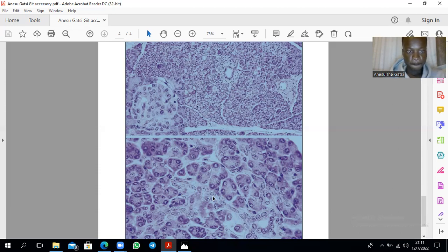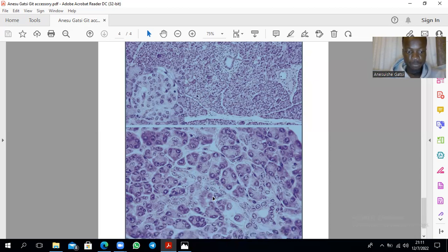Then that's another intralobular duct now. It's a bit larger as compared to the intercalated ducts. So these intercalated ducts will go to the intralobular duct here. So that's pancreatic tissue, and you see these acini. And you don't see the striated ducts that we said are in the parotid, and you also don't see myoepithelial cells. That's just about it.